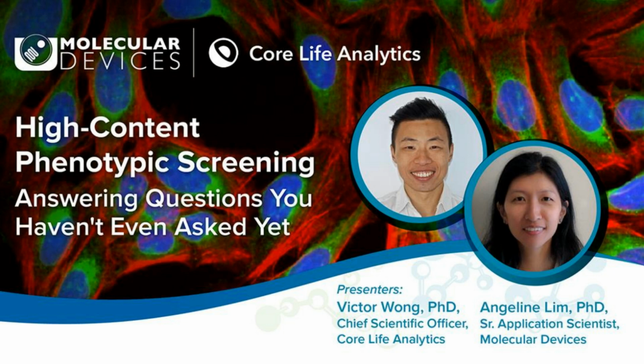Yeah, and in this case, you could also, in the image analysis step, identify cells that have the marker that you're interested in, and I guess you're asking about SOX9, and then just have those two cell populations defined. So yeah.